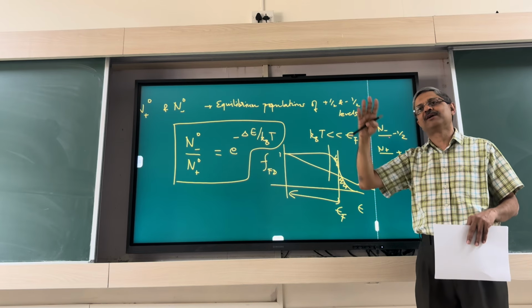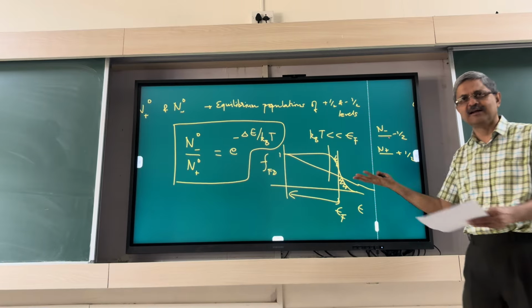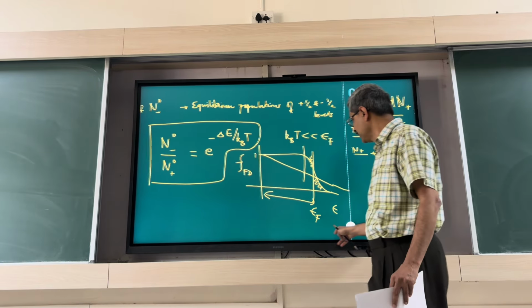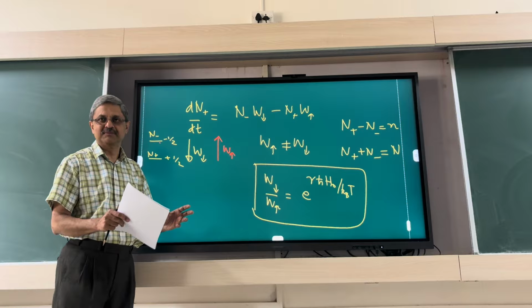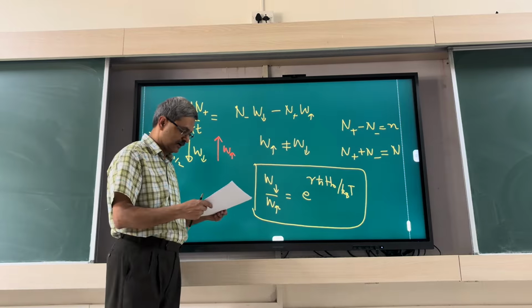It will keep happening forever. These are called Rabi oscillations; we can derive it of course. So you do get population inversion if you have your RF field on for a certain amount of time. There are also classical equivalents which are very intuitive, so we'll look at that.